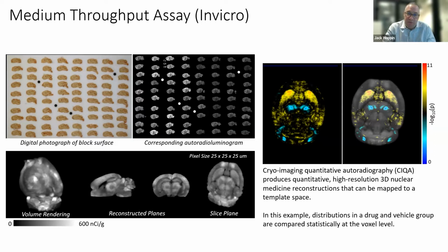But for the fluorophores, it's much easier. Anything you want to image by fluorescence, you can block it and reconstruct it. And I foresee in the future the breakout and comparison of organs using this technology, or tissue resections, just blocking more tissue, setting it and letting it run, and then producing data. I think that's going to be a standard protocol, even if it's just resected tumors. You can get a lot of data.